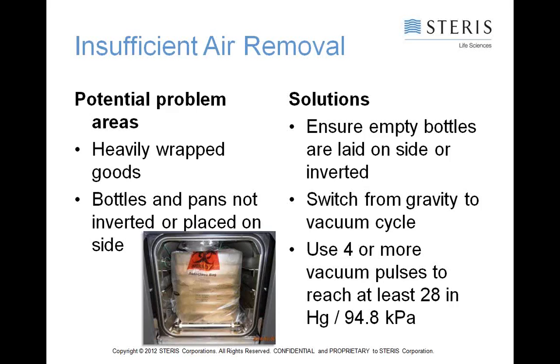You can see one picture here. This was another challenging thing. Those were cages, actually, with bedding in them. They're put together and then wrapped and sealed, and they were being autoclaved on a gravity cycle. They needed to be autoclaved a very, very long time to achieve sterilization, as you can imagine. And the cages started to break down over time, which is not surprising.